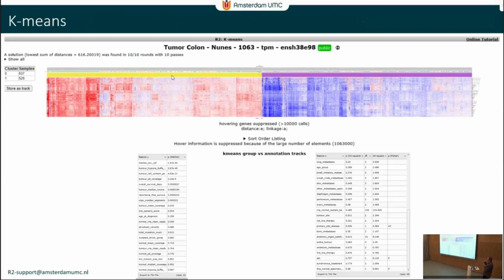If you start looking into things that are a bit less easy to separate, you will find that these color codes are completely running through each other, and that will immediately spark your interest that maybe it's a bit more difficult to do it in this particular way. And then out of all of those runs, it will take the majority vote to essentially attempt to provide you with a new grouping variable that actually then was the basis of this k-means analysis.